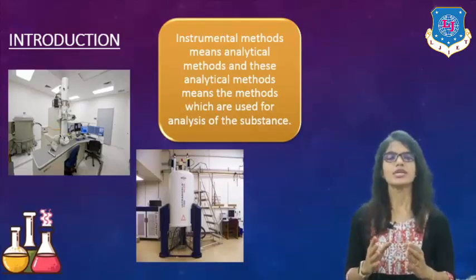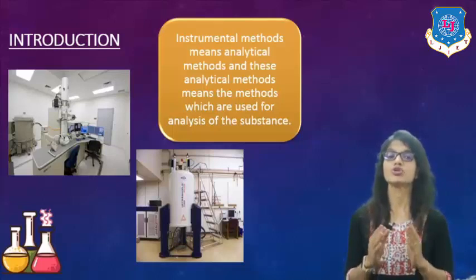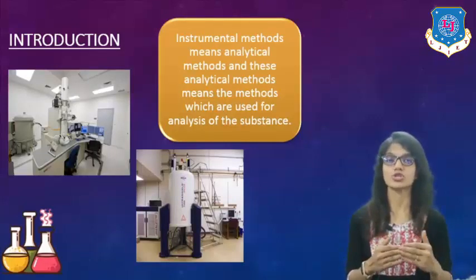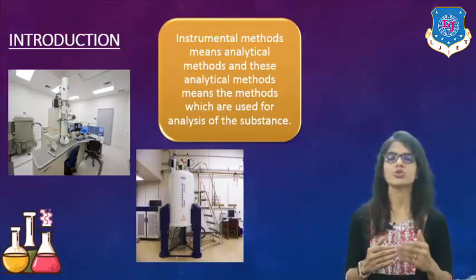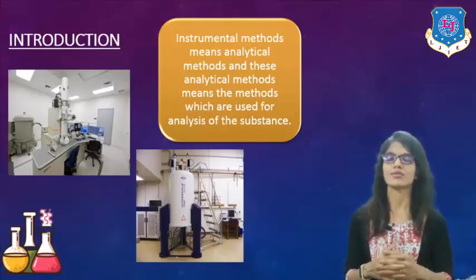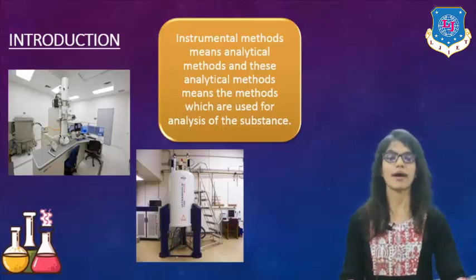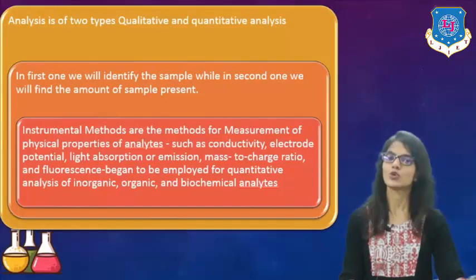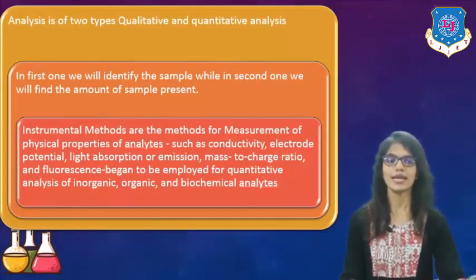So after doing the preliminary examination or chemical examination of any substance, we come to the point where we have to understand what the actual structure and the actual composition of our material is. So here we will go through that, right? The first word that comes to our mind is analysis, and what do we understand by that? To know or to understand any particular substance is known as analysis, right?